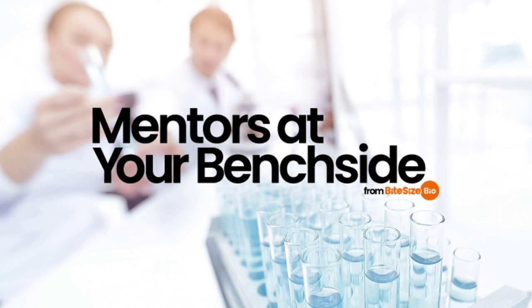So like the UV-vis A280 technique, the Bradford assay depends on the primary sequence of your protein. If your protein doesn't contain a decent number of arginine or aromatic residues, then the dye will not bind to the protein as efficiently, resulting in an underestimate of your protein concentration. And if your standard protein dilutions aren't accurate, then your calculated protein concentration will be off. Also, if for some reason your protein doesn't react with the dye as well as your standard proteins, your concentrations can also be incorrect.